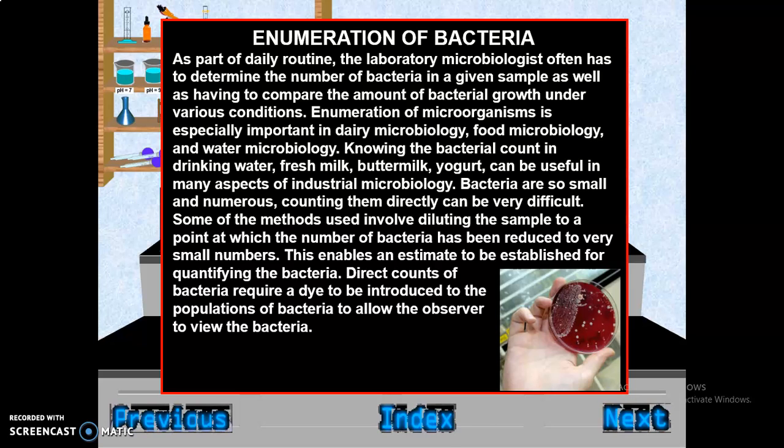Bacteria are so small and numerous that counting them directly can be very difficult. Some of the methods used involve diluting the sample to the point at which the number of bacteria has been reduced to very small numbers.